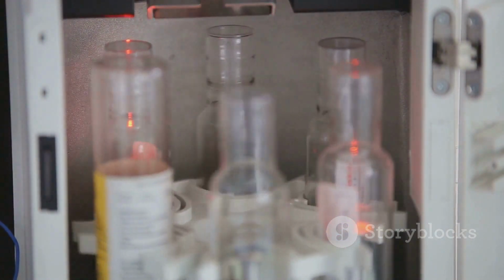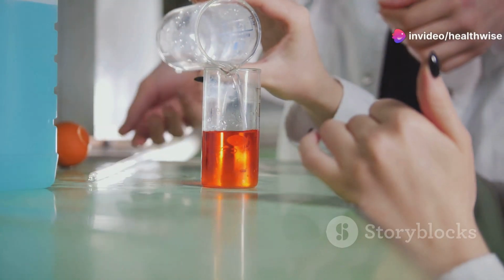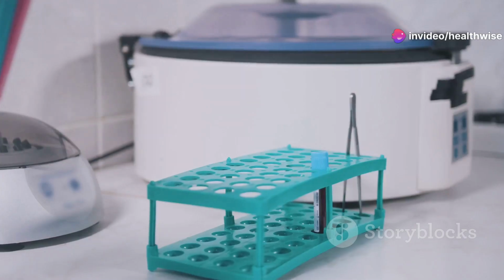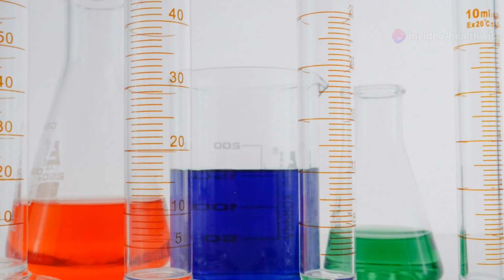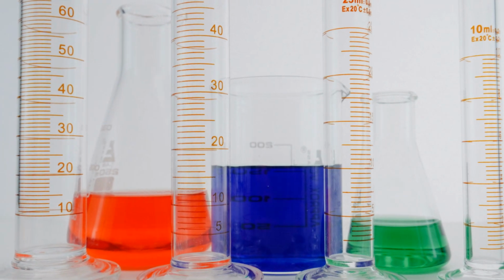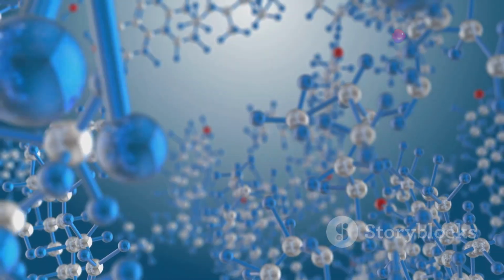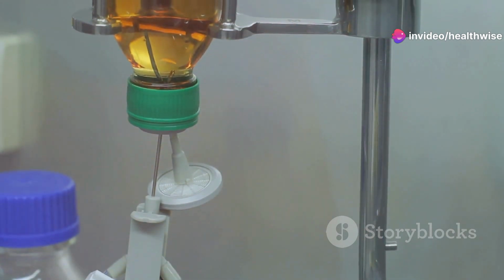Now let's dive into Gel filtration chromatography, also known as Gel permeation or molecular exclusion chromatography. This type of chromatography is all about size. Imagine a big playground slide. Kids of all sizes line up at the top, eager to slide down. As they go down the slide, the smaller kids get caught up in the twists and turns, while the larger kids slide right through. Gel filtration chromatography works similarly.